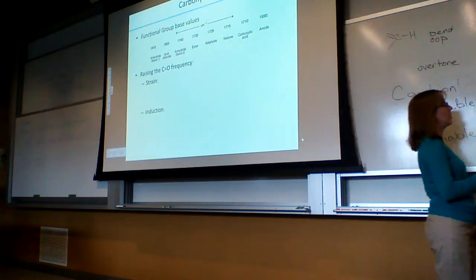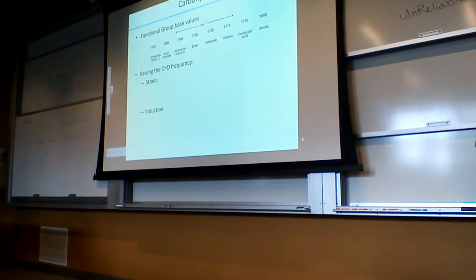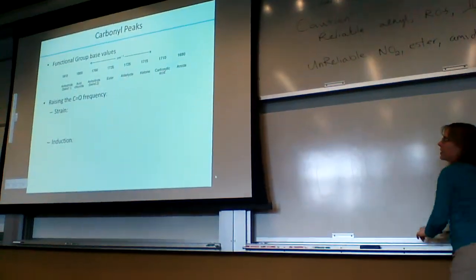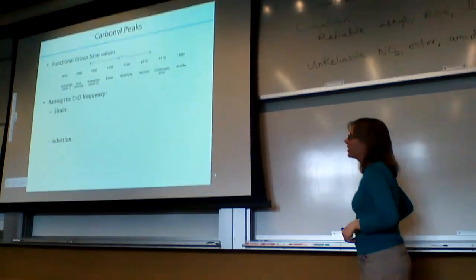You need to know your functional groups in order to assess what's happening within each of these and what's changing them from their base values.